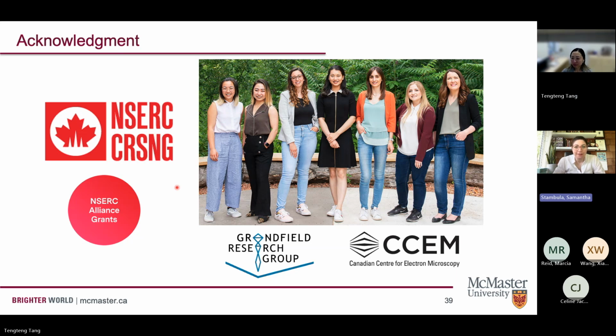I guess I have just a quick question to start it off. In terms of resolution, the highest resolution you've gone to so far is on the PFIB. Is there any desire to push that even into the TEMs or atom probes, since the sample is already in the PFIB? I'm just wondering what your thoughts on that are.